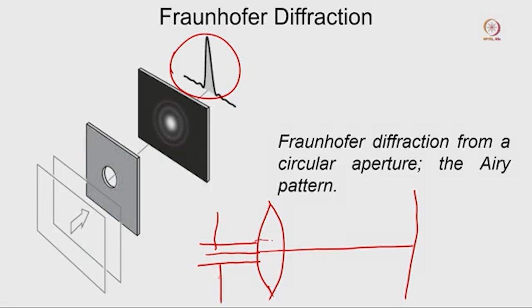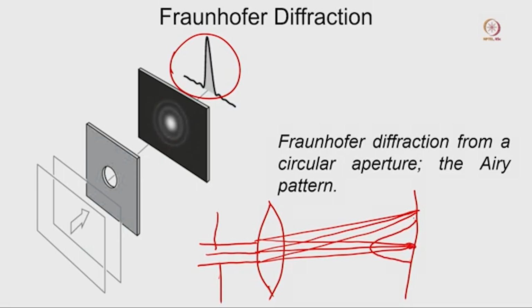On the other hand, those rays will also come and merge somewhere here. Other possibilities is this will go somewhere here, this will go somewhere here, and this will form. So now the similar thing is possible in this side also. Now if we just consider, I am not drawing that part here. If you just go like that, you can see most of the rays are coming and merging here, which is giving us the first peak here.